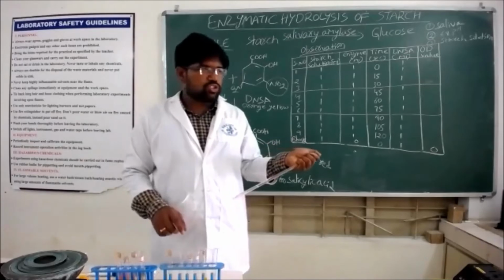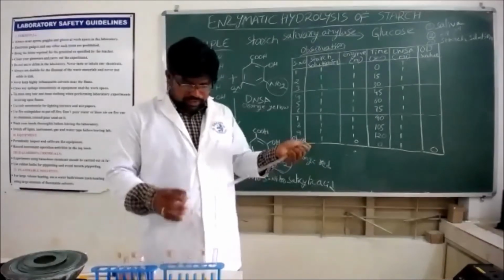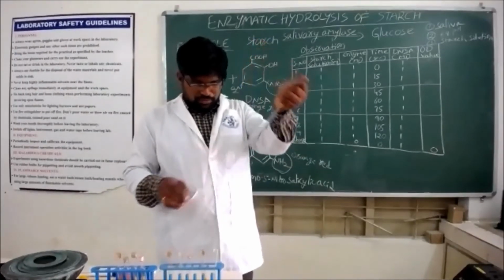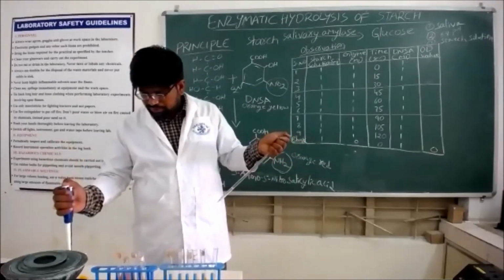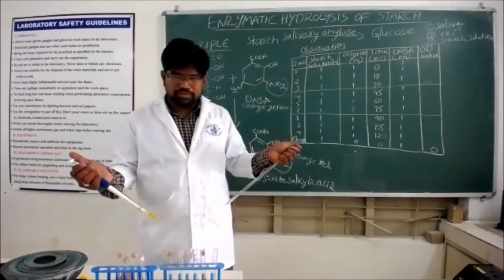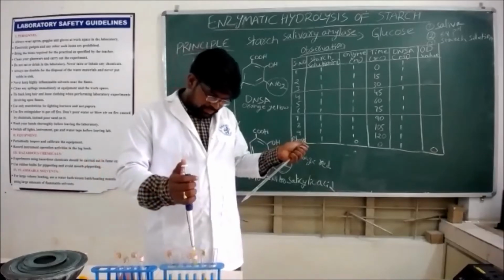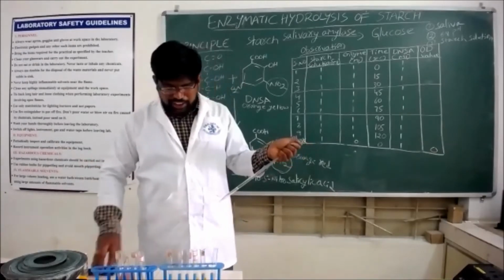So into the second test tube, now add enzyme solution. Exactly wait 15 seconds. Okay, after 15 seconds, add DNSA.